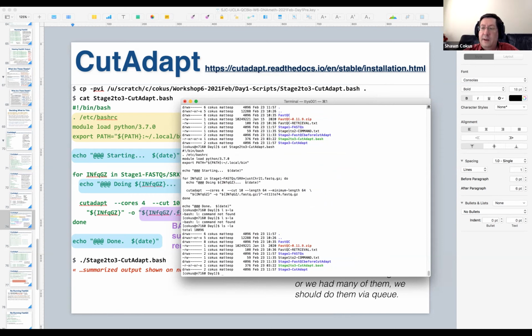And now, how about on your own? This afternoon, why don't you try a stage 4: rerun FastQC on these new stage 3 files, and see if the problems that we saw in the FastQC reports before trimming are solved. They should be solved now, right? We should see flat Q-scores, and we should no longer have the ACGT composition wackiness and all this stuff. You shouldn't have any adapter hits anymore. And so you should now be able to verify with a stage 4 rerun of FastQC on the stage 3 output that the FastQC reports look better now.